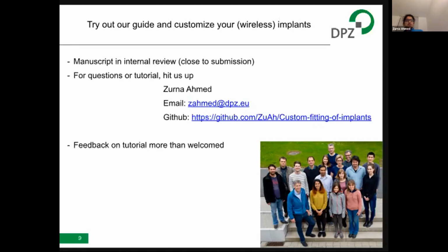Yeah, exactly. We are also using the recent MRI scans and CT scans. And we do not have any, or at least I do not have any, experience with macaques younger than 5, because usually in our lab we start around 6, 7. Like 7 is more the starting age for implanting.